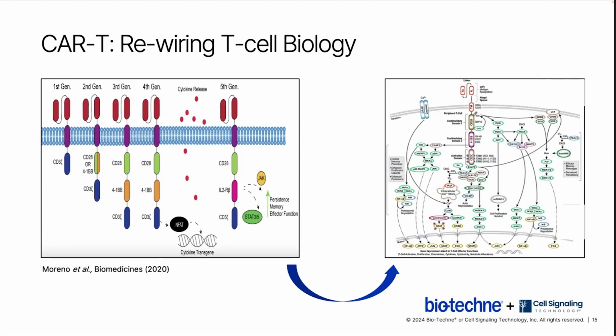these potential therapeutic modalities. With this in mind, Chris will next describe a streamlined workflow to engineer CD19 CAR T cells. Using these cells, we will then aim to highlight how multiple analytical platforms can be leveraged to interrogate CAR expression, signaling, and CAR T cell function following antigen engagement.